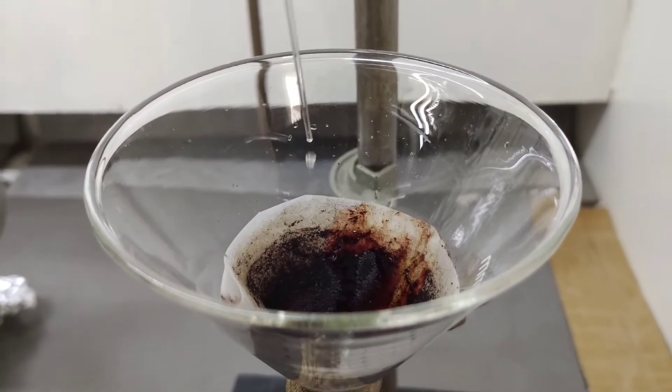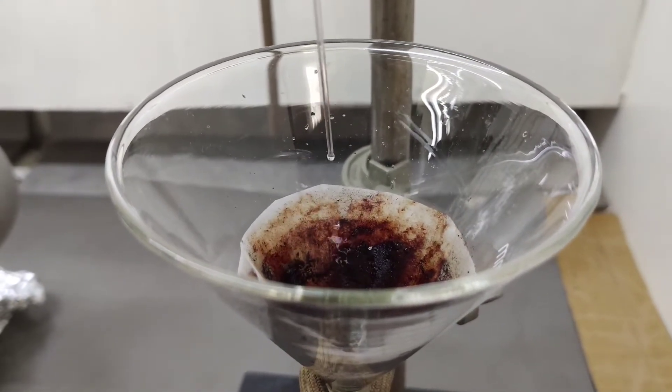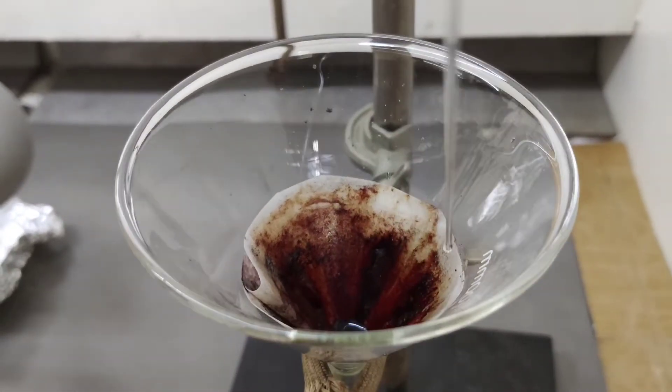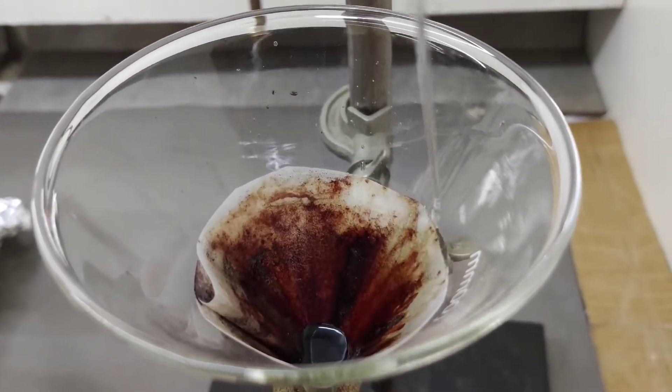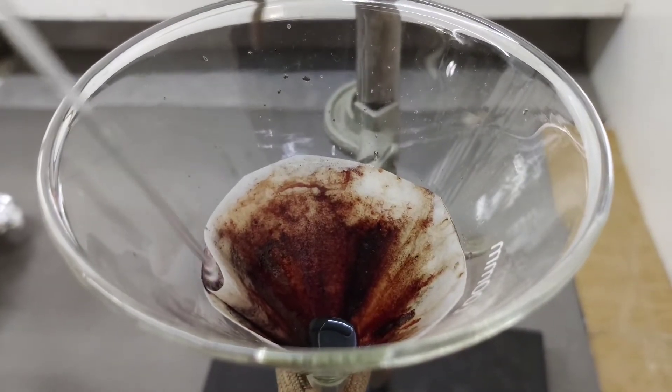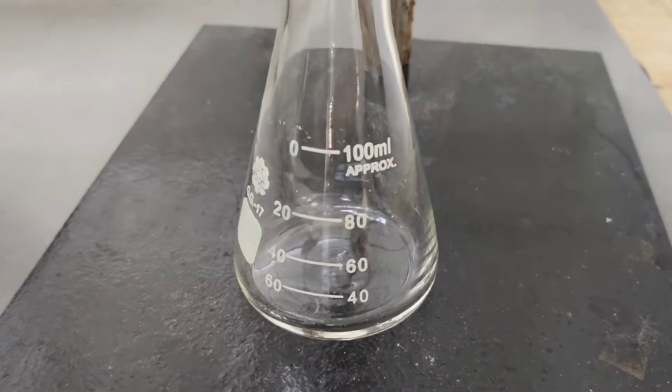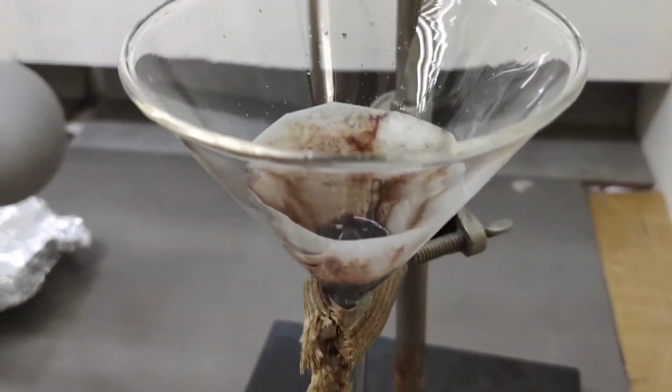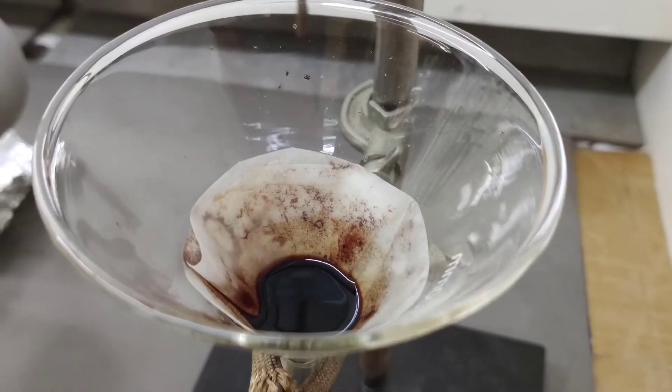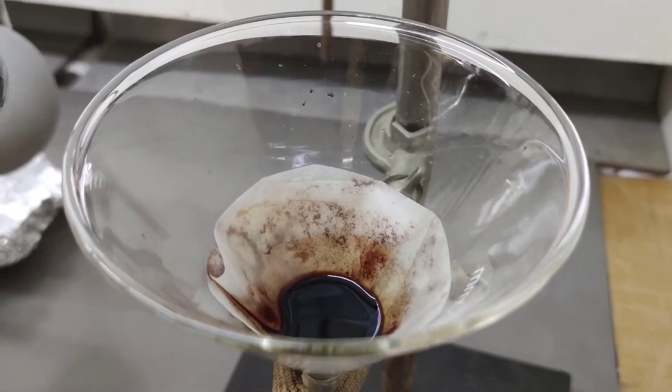We see here that the DCM dissolves the corrole but the solution doesn't go through the filter paper because the filter paper is still wet with water. So we are going to use a little bit of methanol to help dissolve the water into the DCM.